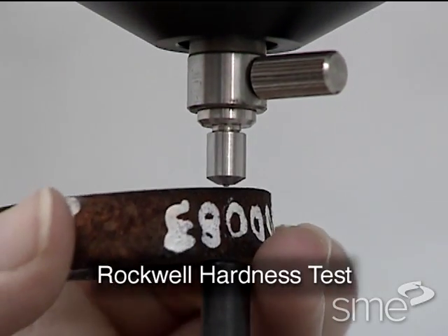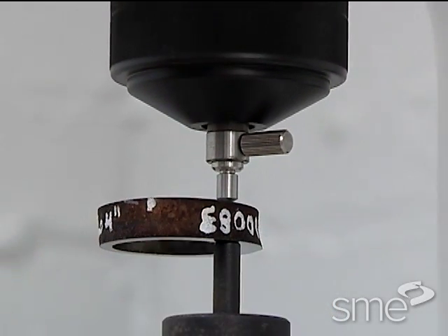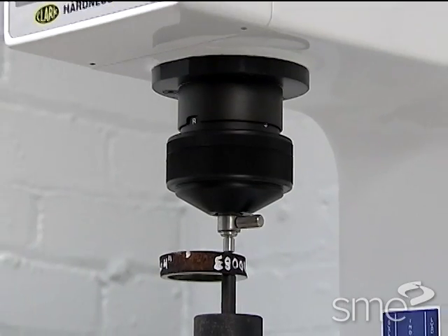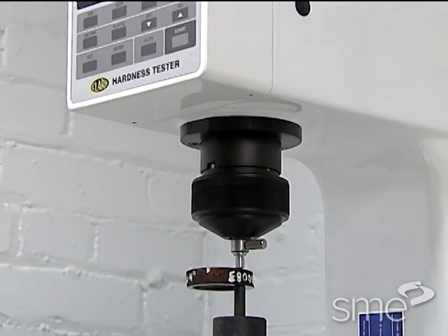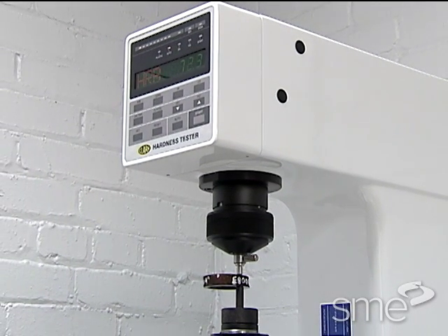The Rockwell hardness test involves the use of an indenter for penetrating the surface of a material, first by applying a minor or initial load and then applying a major or final load under specific conditions.